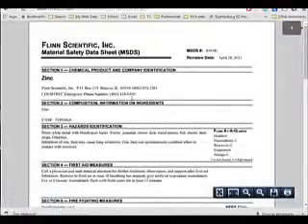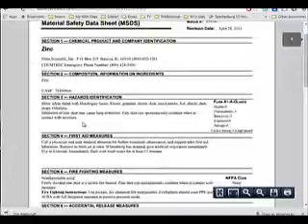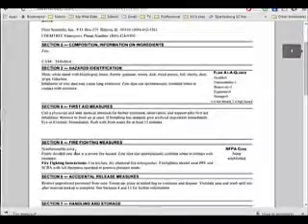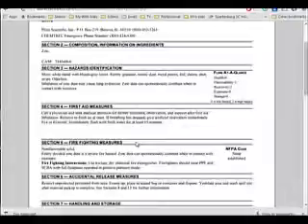Got that? Now, we're looking for hazards, both health and fire hazards. Now, this is first aid measures and firefighting measures. We don't need to know how to fight a fire, because you're not going to be fighting a fire. The only kind of fighting a fire you're going to do is if I catch on fire, in which case you might throw the blanket on me, or you might spray me down with a fire extinguisher, but pretty much you're not going to be worried about this stuff.